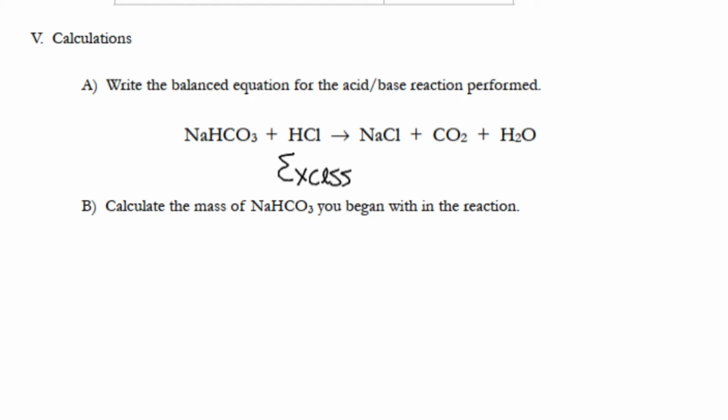There will be a squeeze bottle of hydrochloric acid sitting at your lab table. Guys, it's 1 molar, which means if you get it on you, eventually it'll eat through the oils on your skin and it's going to itch. If you get it in your eyes, you're blind. But if you get it on your skin, it's not really life or death. Run it under water, wash it off with soap. We don't have to drown you in baking soda. It's not that strong. But certainly if you get it on you, you're going to want to wash it off. And if it does get red and itchy, please let me know, and then we will do the baking soda thing. But it's not crazy.